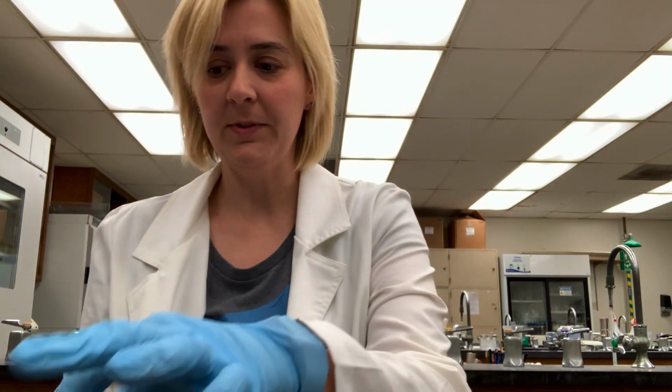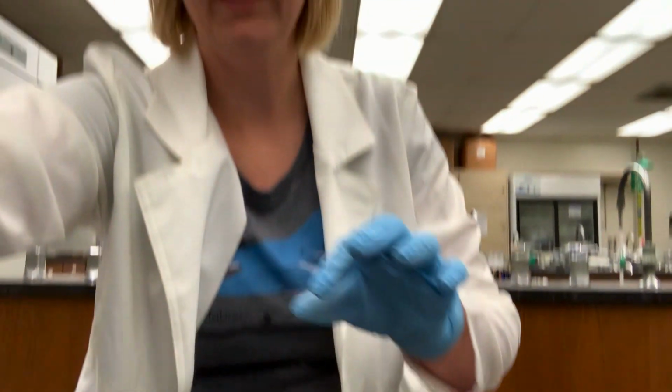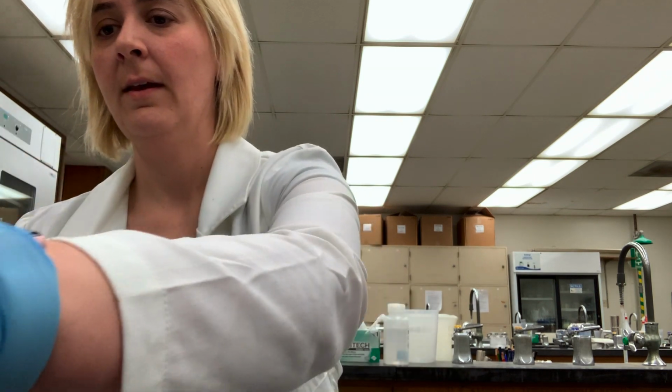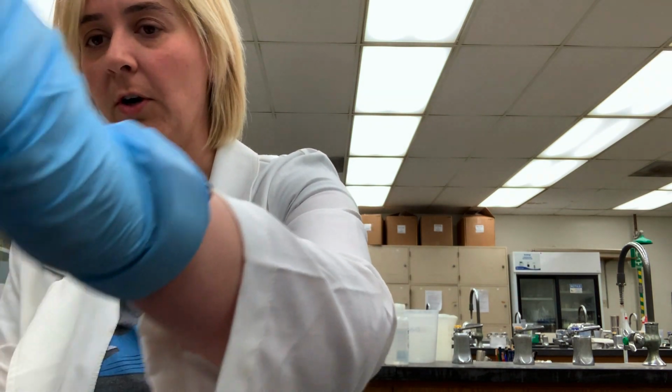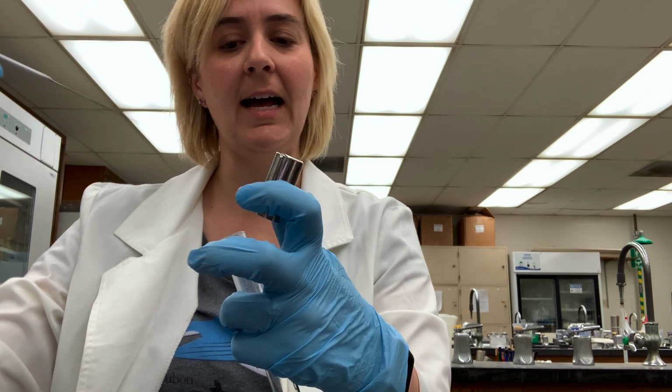coli to do this. So I've already cleaned down my lab bench, everything is sterile. I'm going to take a microscope slide, and I've got down here a little setup where I can put my slide. So I will sterilize my loop. Here's my sterile loop. Let it cool down for just a second. I'm going to take a loop full of culture and spread it on my clean glass slide.